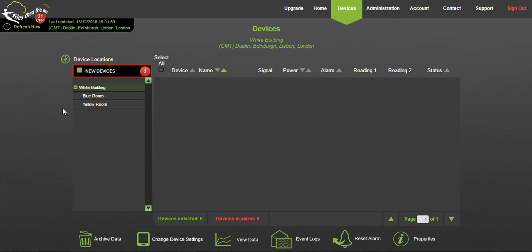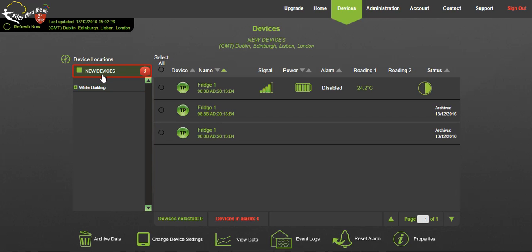Any device added to the cloud can be found under new devices. To view or change settings select the desired logger. At the bottom of the dashboard you can see a number of icons which show the activities that you can view, manage or change for each device.